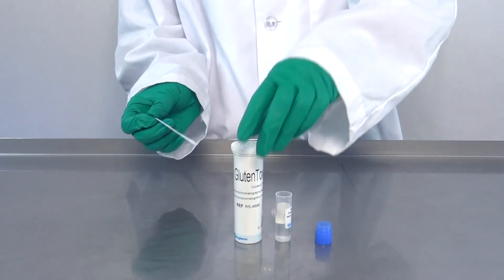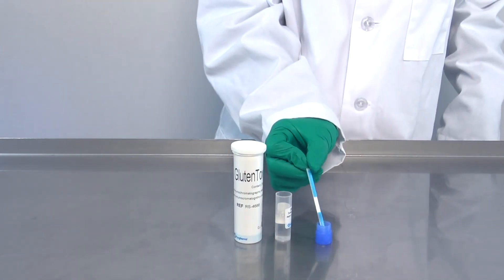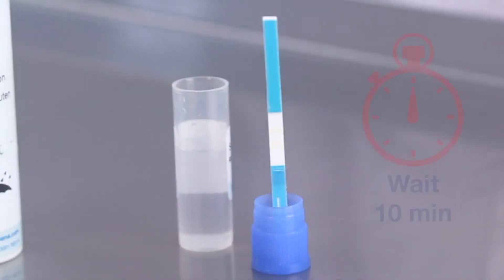Take a GlutenTox stick and place the cotton wool side of the stick into the blue cap until all the liquid is absorbed. Let it stand in the blue cap. Wait 10 minutes to see the final results.